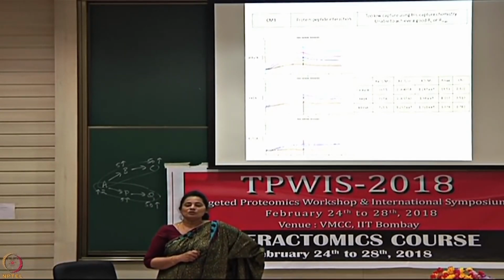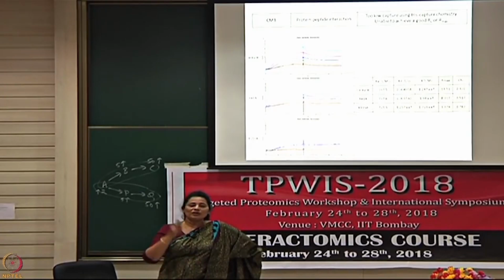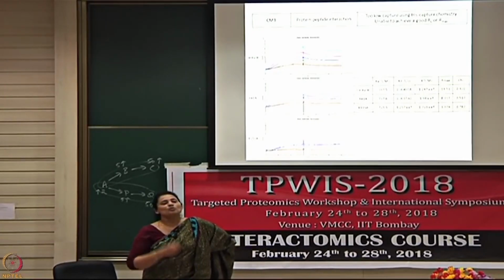So when do you start dissociating? How do you determine for what time I need to run the analyte? When do I stop and start dissociation? Very critical. Can I say arbitrarily I'll run it for 10 seconds and I'll wash it off? No. So what determines it?